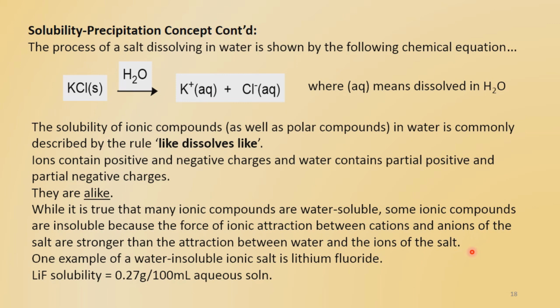One example we're going to look at is a water-insoluble ionic salt called lithium fluoride. The solubility of lithium fluoride in water is only 0.27 grams per 100 mL.